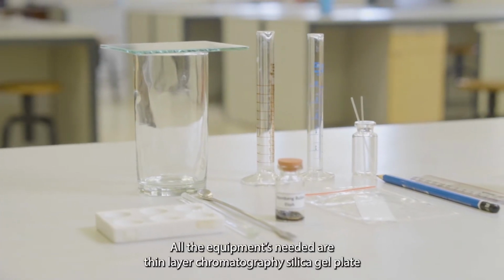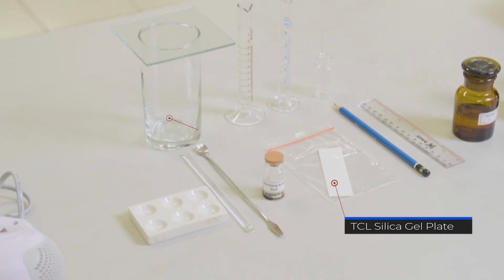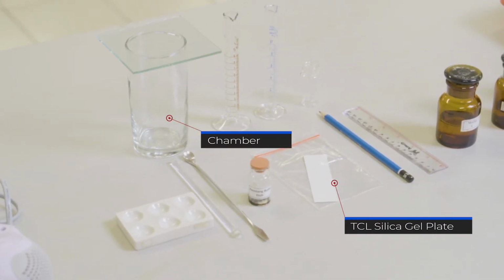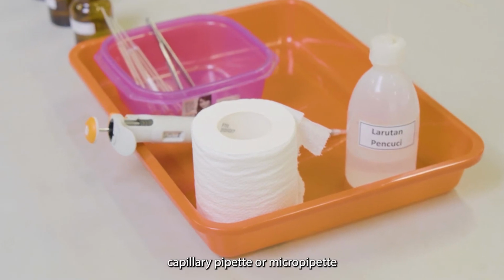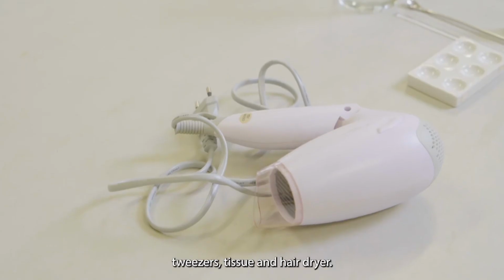All the equipment needed are a thin layer chromatography silica gel plate, pencil, ruler, chamber, capillary pipette or micropipette, tweezers, tissue, and hair dryer.